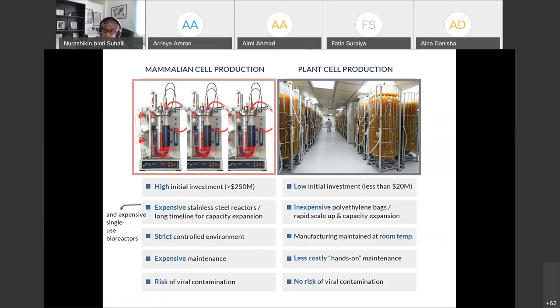Just now, I used single-use bioreactors. It's part of the maintenance. It has its own platform for operating the single-use bioreactors. That is a paid one-off, one machine. But the cassette is what has to be replaced every single time. That is considered maintenance. So the whole machine that I used was about £70,000. That is the initial investment. The maintenance is the single-use bioreactor cassette that I used in every experiment. That is an example of maintenance. So every single time, it has to be replaced.